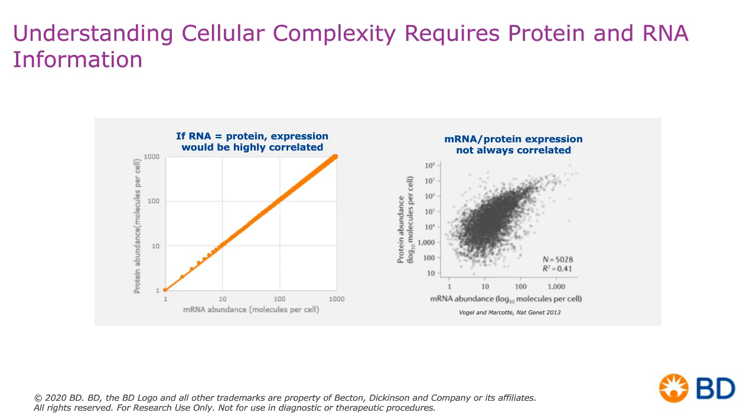And this correlation tells me that if I'm just focusing specifically on my mRNA expression and information, I'm probably losing a lot of information about what the cell is actually doing, because mRNA just tells you it can make the protein, but it doesn't mean it's there. It doesn't mean it's functional. It doesn't mean that if I have a CD8 T cell, it's going to be actively attacking and killing something because it actually has granzyme A or interferon gamma. Instead, I might just be reading out it has the potential to do that. It may just have mRNA for those proteins, but no actual protein present.